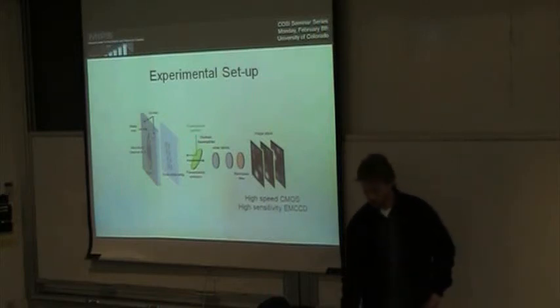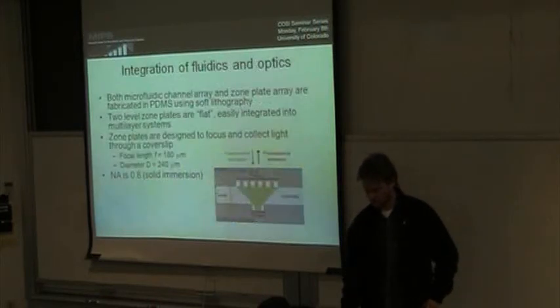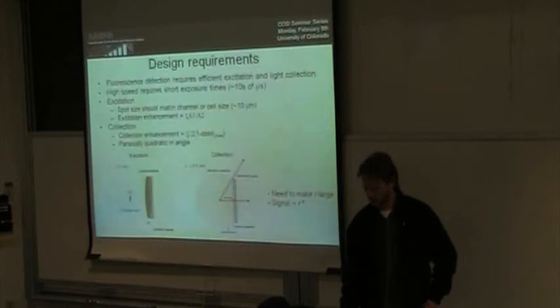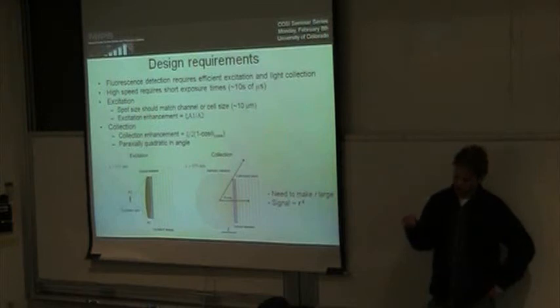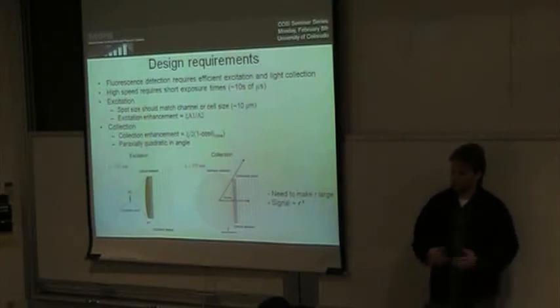But flow cytometry, which is an established technique, also addresses the same problem. What they do is they have some nozzle that creates, and there's a variety of ways to do it, sometimes water droplets in air. These are small, probably twice the size of the cell, so 20 microns. It probably creates them at hundreds of thousands of drops per second, and then they load it in such a way that 1 out of every 10 or 100 drops have something in it.